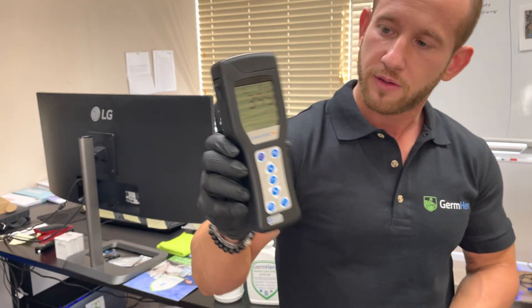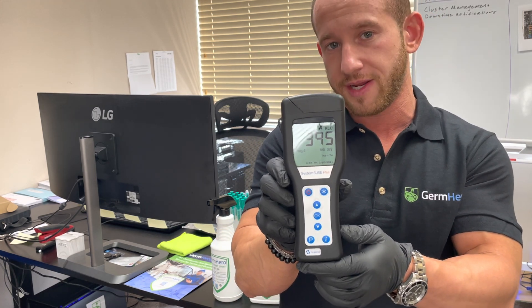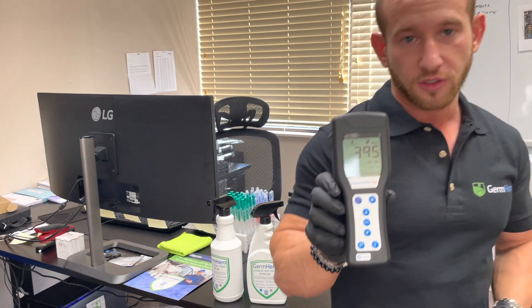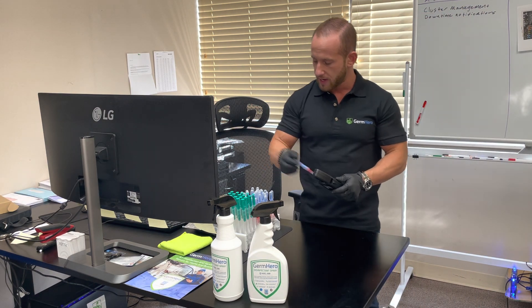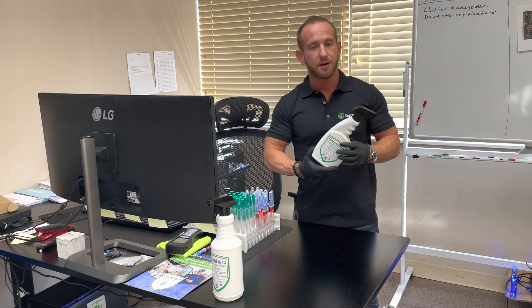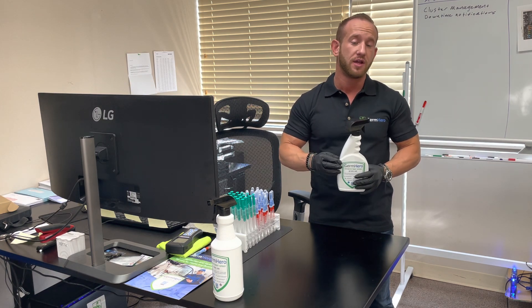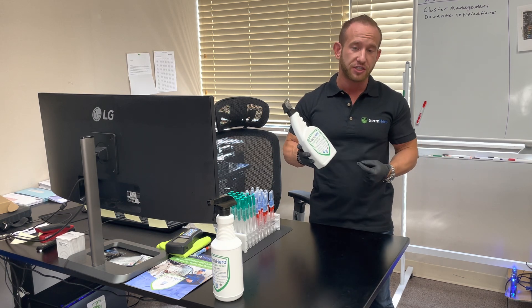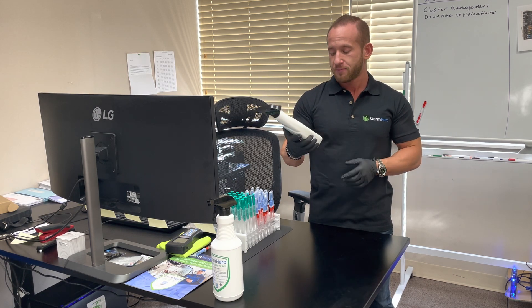We got our RLU measurement — we got a 395. Anything generally above 200 is pretty contaminated, so we definitely want to disinfect that surface. Now, Germ Hero's HOCL disinfectant spray is made up of hypochlorous acid. Hypochlorous acid is actually a natural, fully organic compound found within the human body — it's what the body produces to fight off internal infection and harmful illnesses. We've been able to bottle this and make it available to customers and business clients.